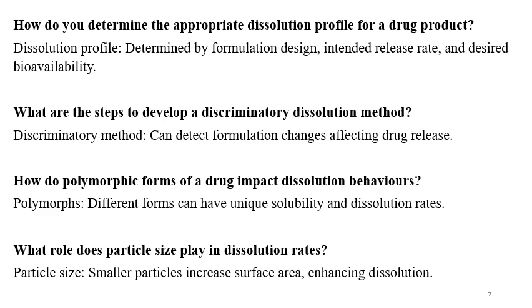How do polymorphic forms of the drug impact dissolution behavior? Polymorphs differ in the intrinsic solubility and dissolution rates. That's why it affects the dissolution. Different polymorphs have different unique solubility and dissolution rates.